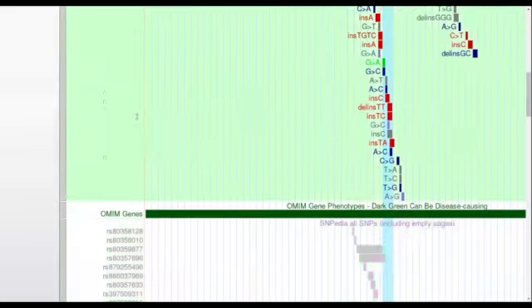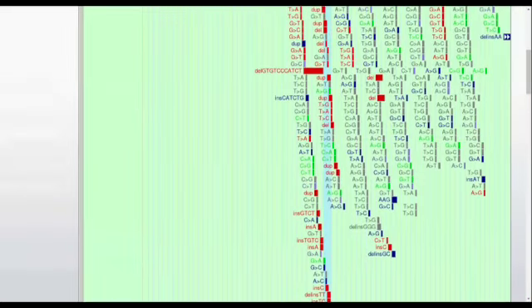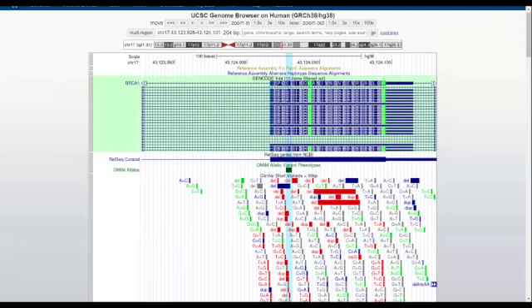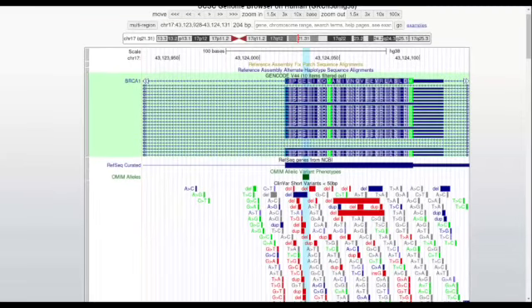Okay. Yeah, and then can you go up all the way? Right now, the first one shows all the isoforms of this BRCA1 gene in the UCSC, and the second, according to RefSeq, is the NIH's reference sequence integration, the standard gene model in their database.